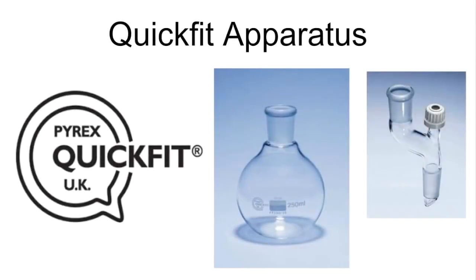In this video I'm going to look at the specialist glassware that we use in organic practicals, known as quick fit apparatus. The quick fit apparatus has a special ground glass joint, which means that when you put two pieces together you get a very good seal between the two pieces of glassware, and it ensures that you don't lose any vapours.